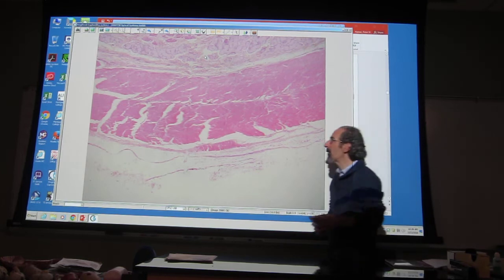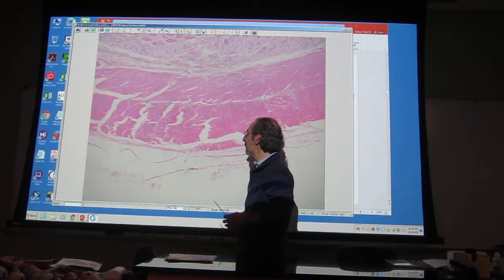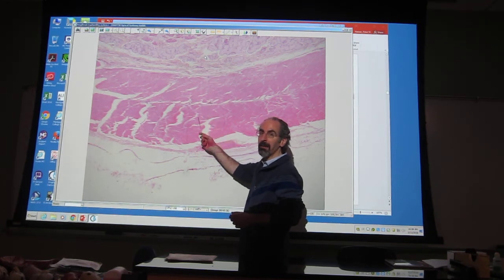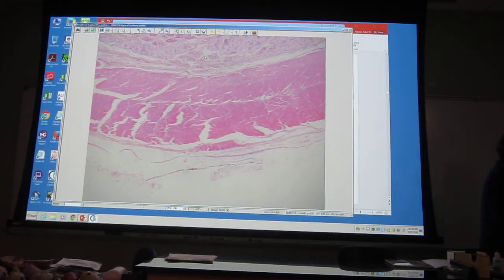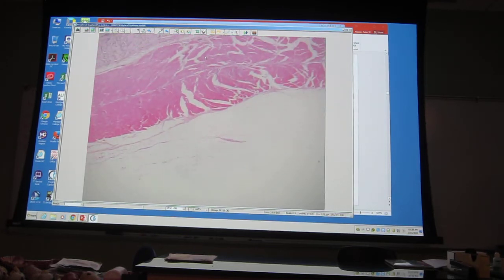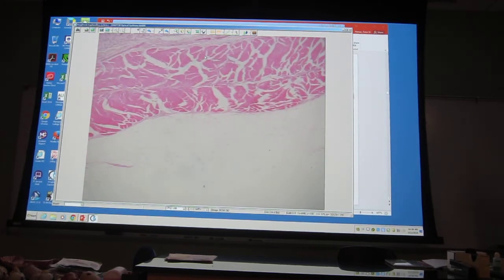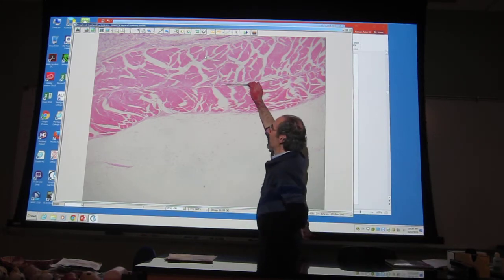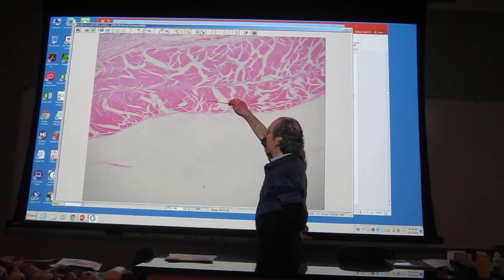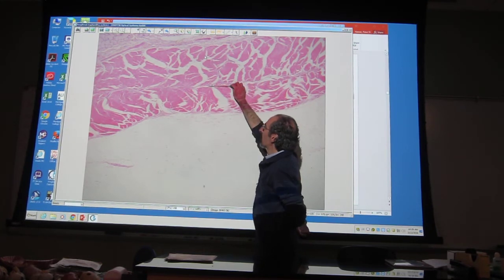In the esophagus, it's not always easy to distinguish, again, depending on the slice, the inner versus the outer in terms of when we look more closely at the orientation of the smooth muscle, it may not be exactly how we like it. Professor Alexic had a nice view of it there on my slide. It's not as nice, but you can see sort of a line of distinction here. My colleagues may disagree with me and may have a different opinion of this, so I apologize if I get this wrong, but I would just call this the inner circular layer and the outer longitudinal layer here, and put the dividing line roughly about there.